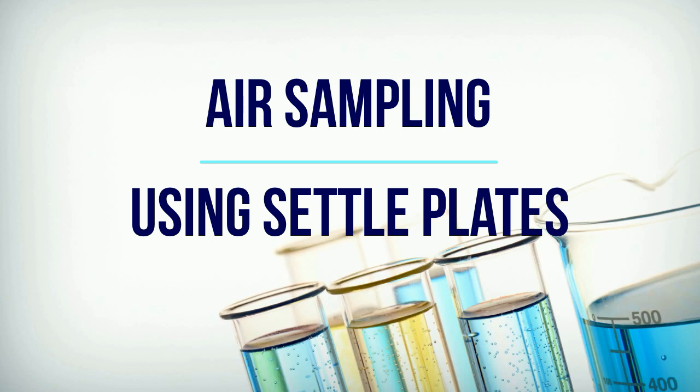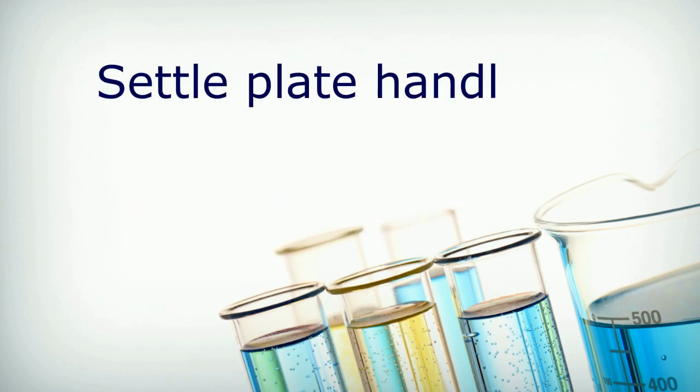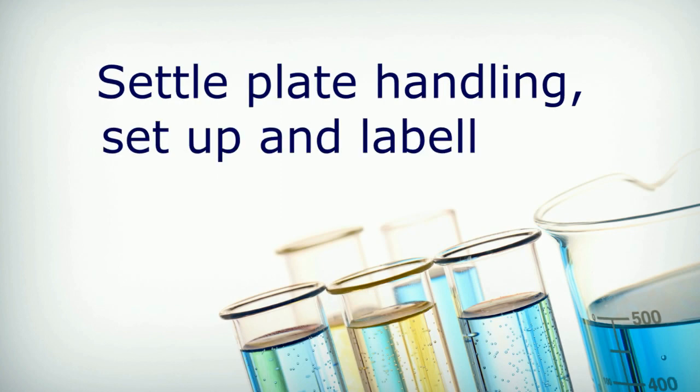Settleplates are used to directly sample the likely number of microbes depositing onto a product or work surface over a set time period. The following is a best practice technique for the exposure of settleplates in the production environment.